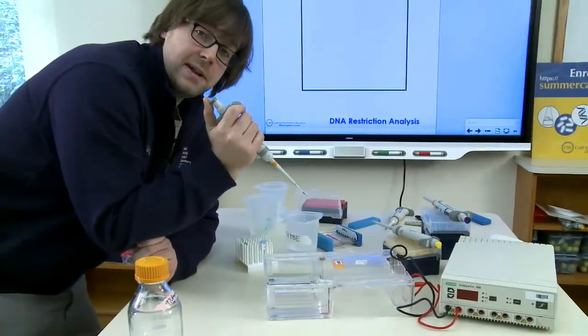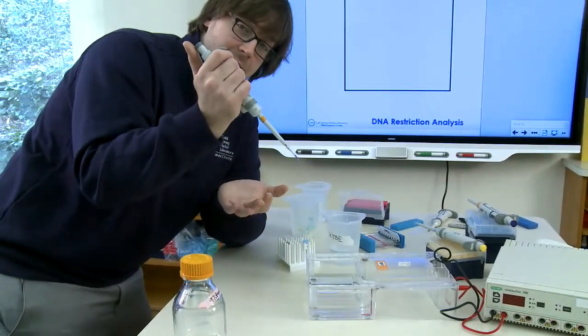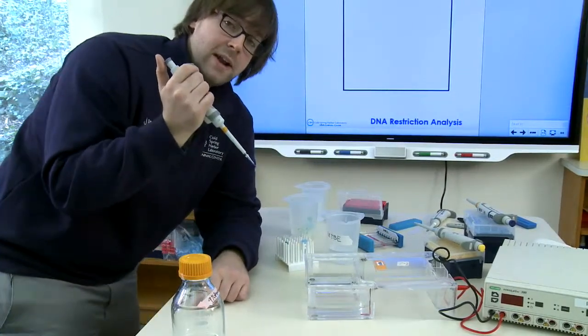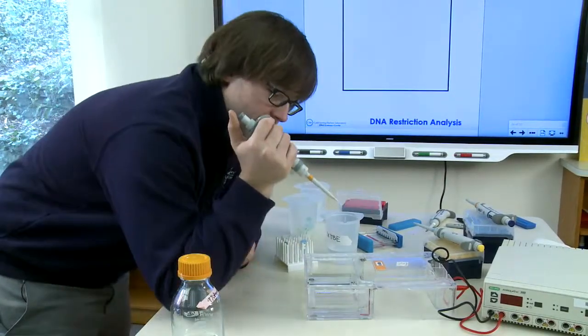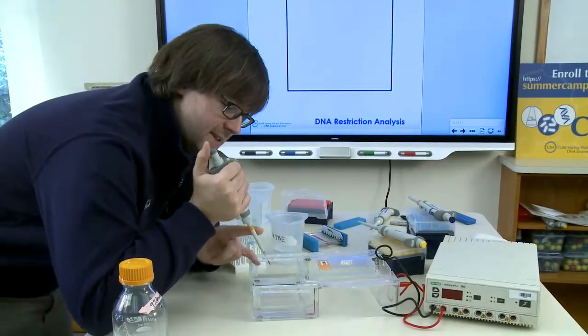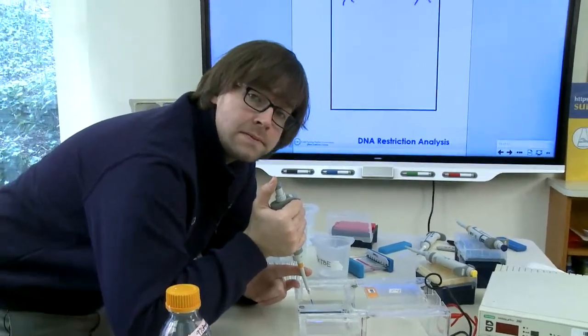It's all about stability. So I drink a lot of coffee, so I shake a lot. So my hand is already shaking right now. And so I have to make sure that I'm being very stable in the way that I do this. So what I like to do is put my elbow on the table, stabilizing my hand, and then I use the other hand to guide the tip of the pipette right into the well where your sample needs to go.